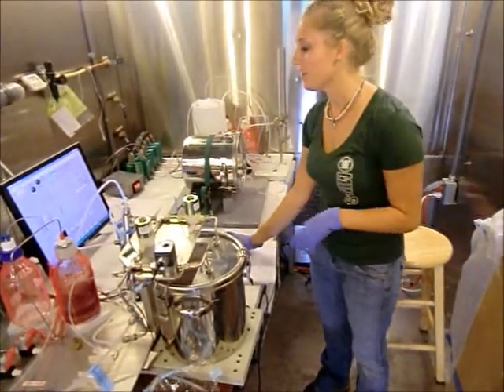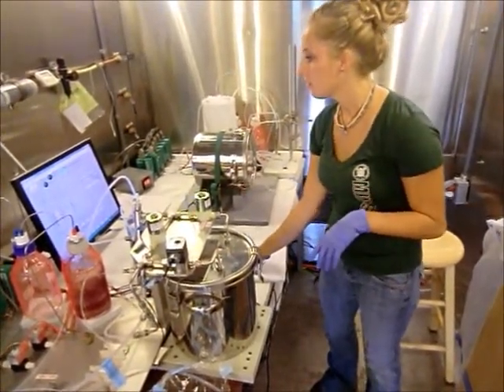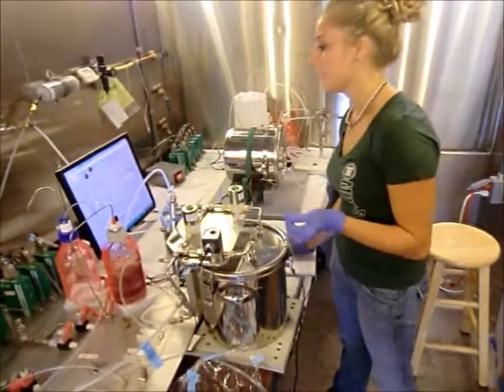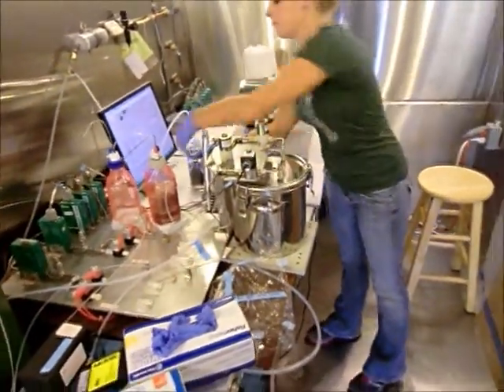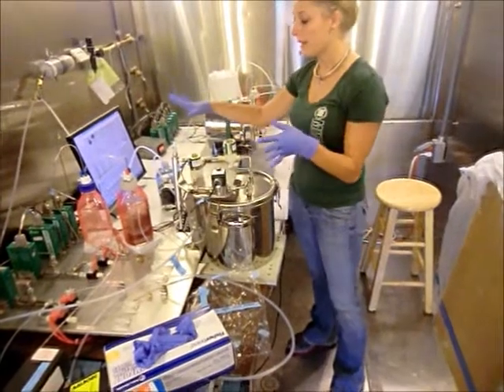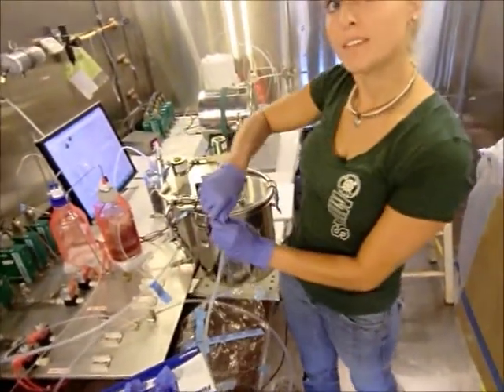So I would pull it up, and then I would reset the date so that it's the proper timestamp. Then the next thing I would do is check the flow rates to make sure that everything's working well with the system. The first place I check is if it's completely bypassing the system and it's all just going through to the activated carbon.